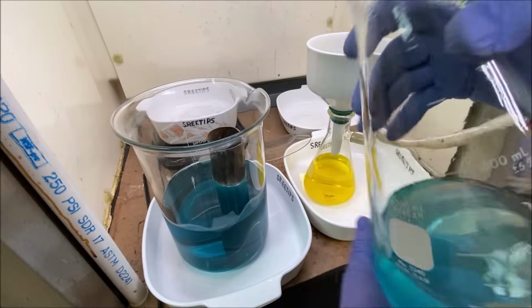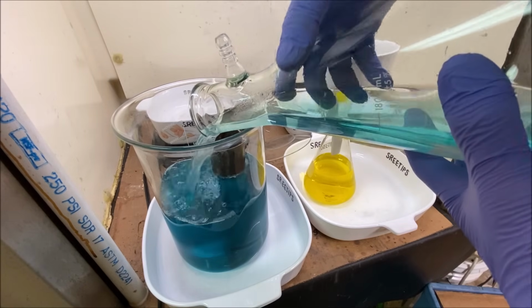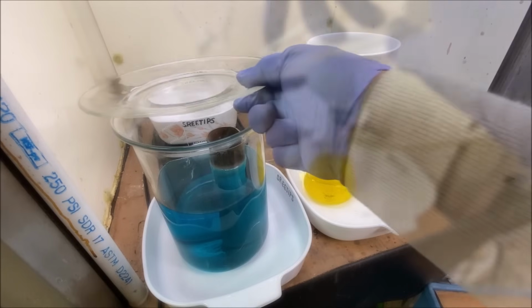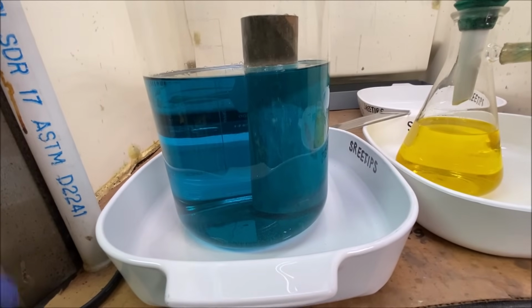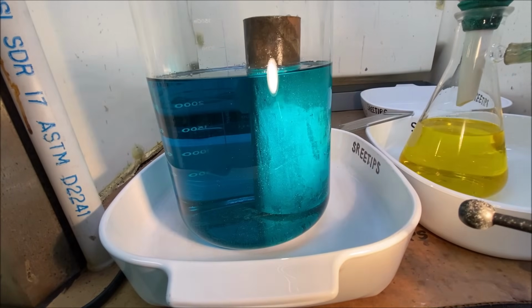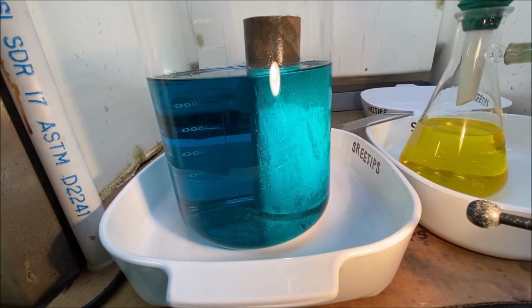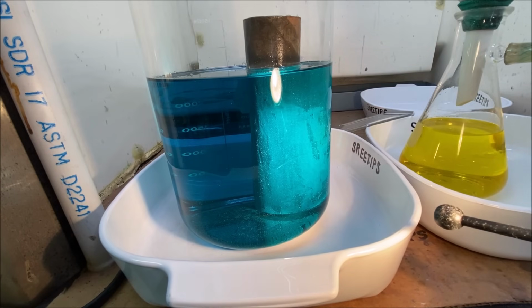Here's the rest of the silver solution that I collected when I was filtering the solids out. Now we'll cover this up, and you can see the silver is coming out of solution on the copper in there. See that? Silver will cement out. Copper, being more reactive, will go into solution, while the silver that's in solution, being less reactive, will come out of solution.